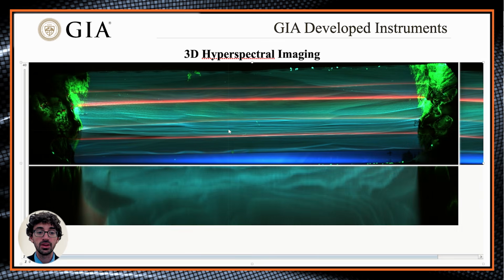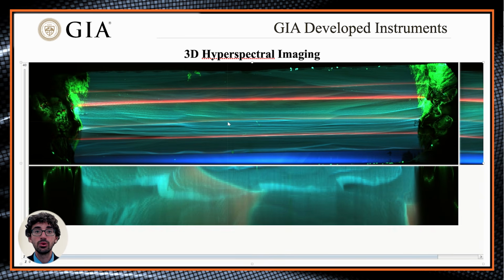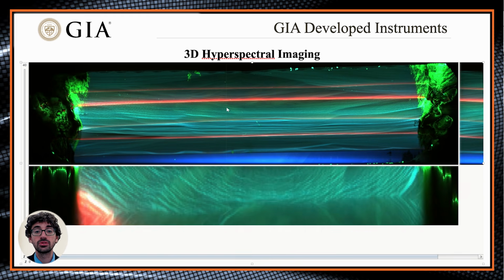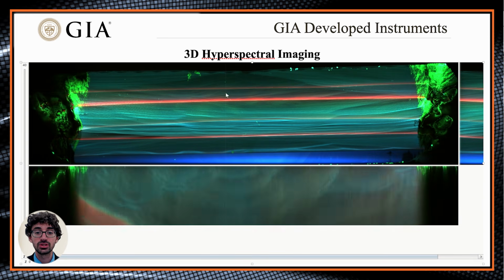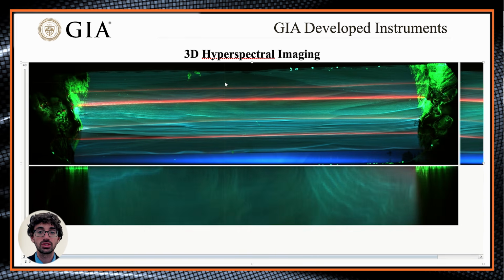The following video shows how this diamond evolved in the reactor, the step flow growth that is caused in a CVD reactor, incorporating different concentrations of defects as this diamond grew with varying conditions. And we are seeing this growing up from the substrate into the reactor plasma itself.